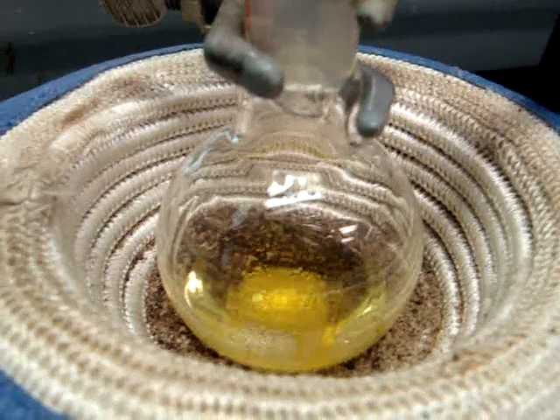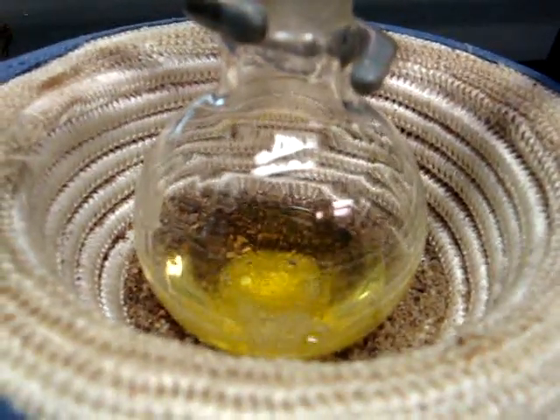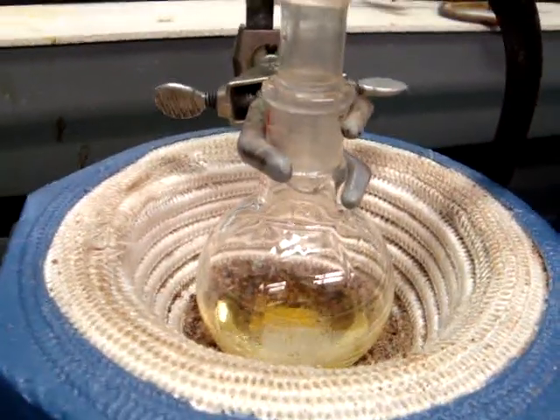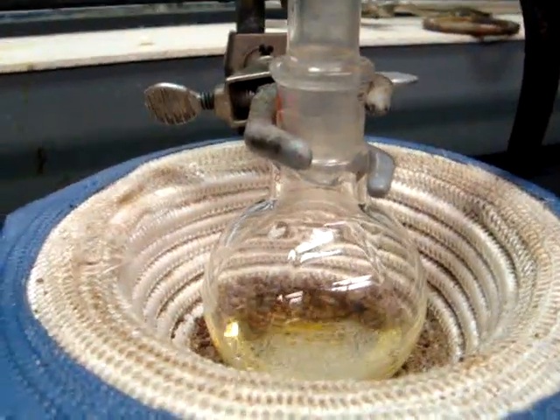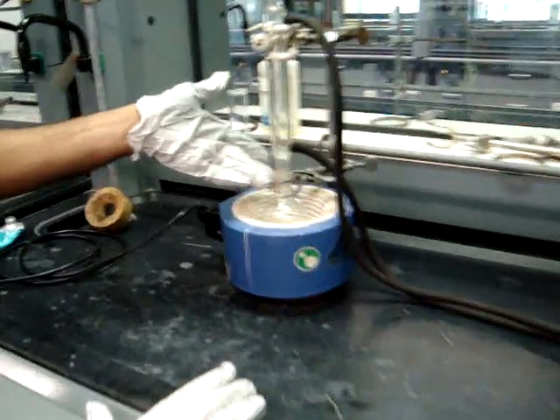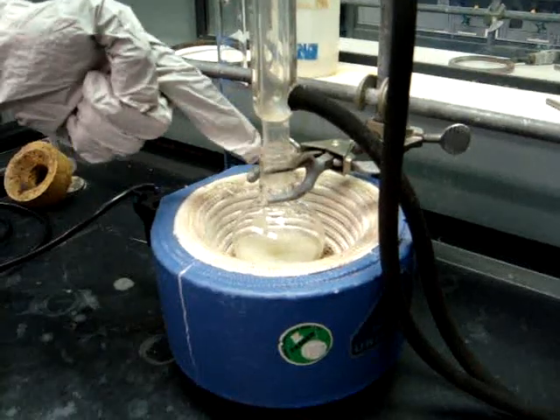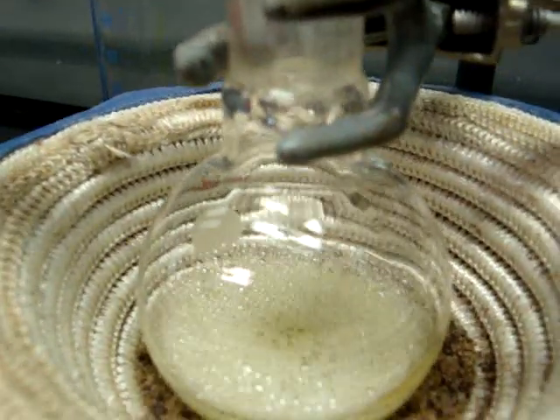As you can see, the solution is starting to bubble, which means the heat is working. Once it begins to reflux, that is when you start your 30-minute timer. This is where you can tell the solution has begun to reflux — as you can see, it is condensing up into the condenser.